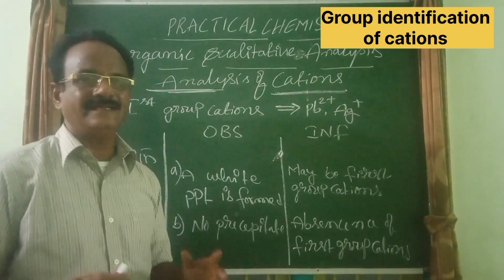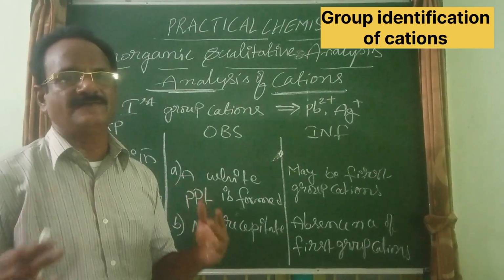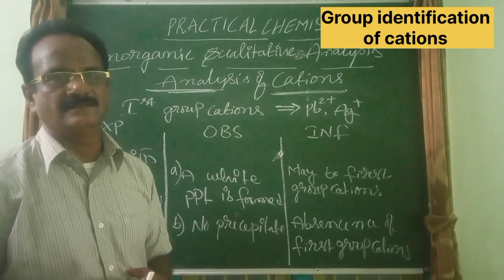Is it clear? Then the analyst has to go for identification of second group cations. Is it clear?